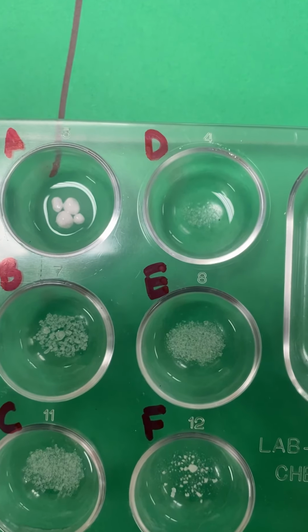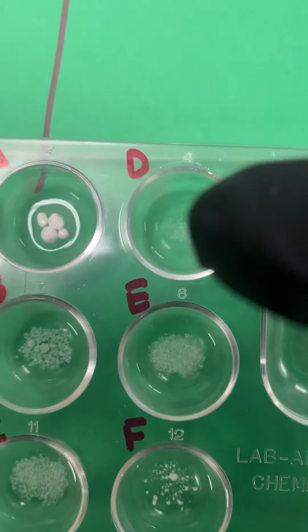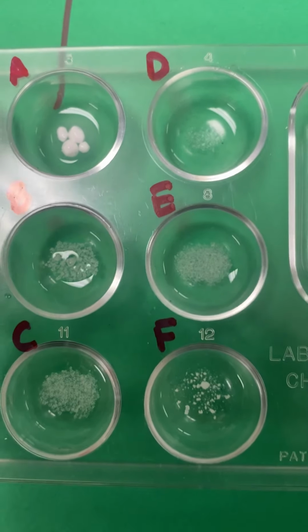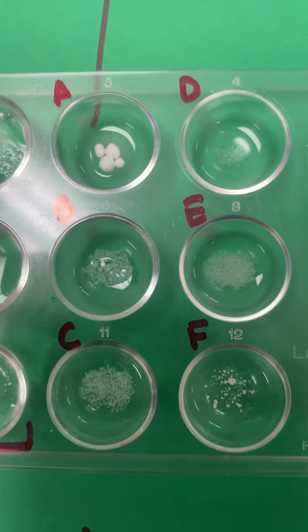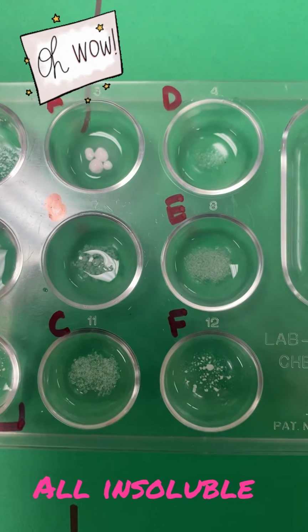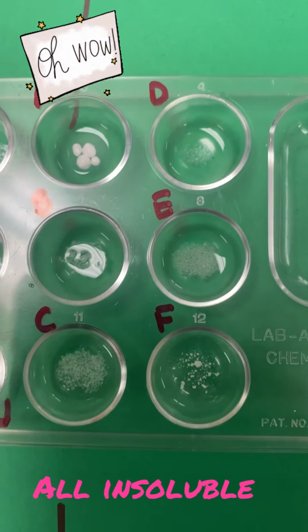What do you think? I still see crystals. Yeah, I can see it. Kind of looks filmy right there. It's kind of hard to see in the phone, but E definitely still sitting there, and F definitely still sitting there. So did any of the ethanol dissolve at all? No. They all look like they just separated.